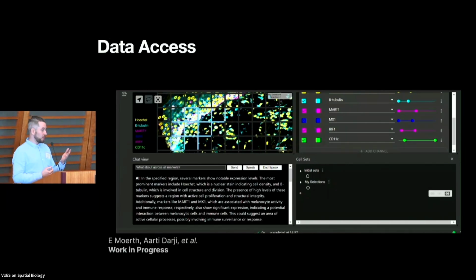And what both Clarence and Peter highlighted is often, I think Peter called it the eyeballatron. So I think it's super funny that you can now actually go in and say, this area is interesting. Can you show me similar areas in my data? Or how often does this occur in my data? And then you can go through them and inspect them individually without having to zoom and pan the whole data set all the time.